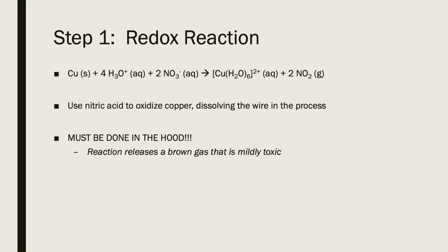And the reason I say it has to be done in the hood is as you do this reaction, you're going to notice there's a brown gas given off. That's this nitrogen dioxide gas over here. This is a slightly toxic gas, and so we have to do this reaction in the hood so that we're not basically exposed to or at risk of just inhaling these vapors.